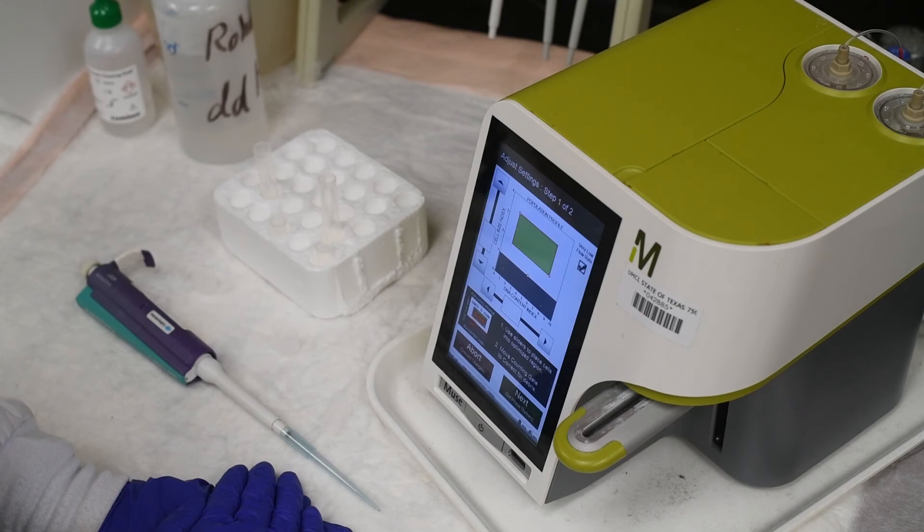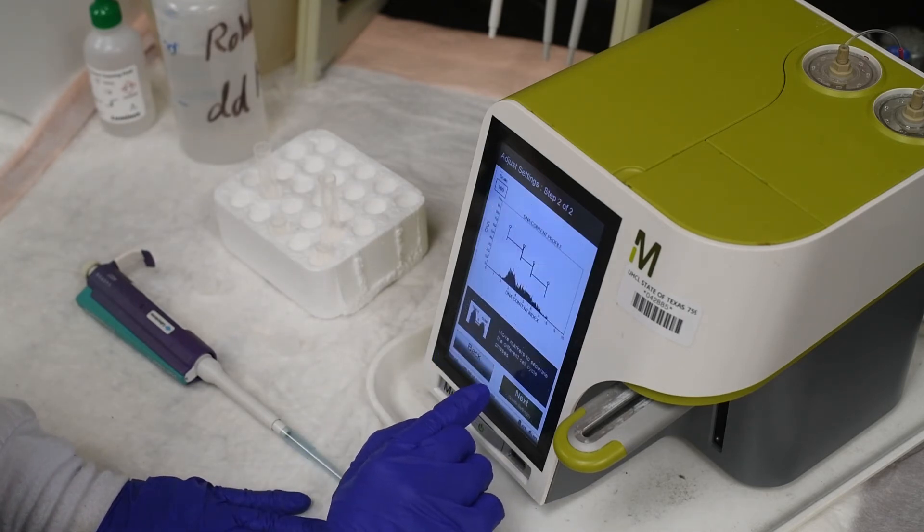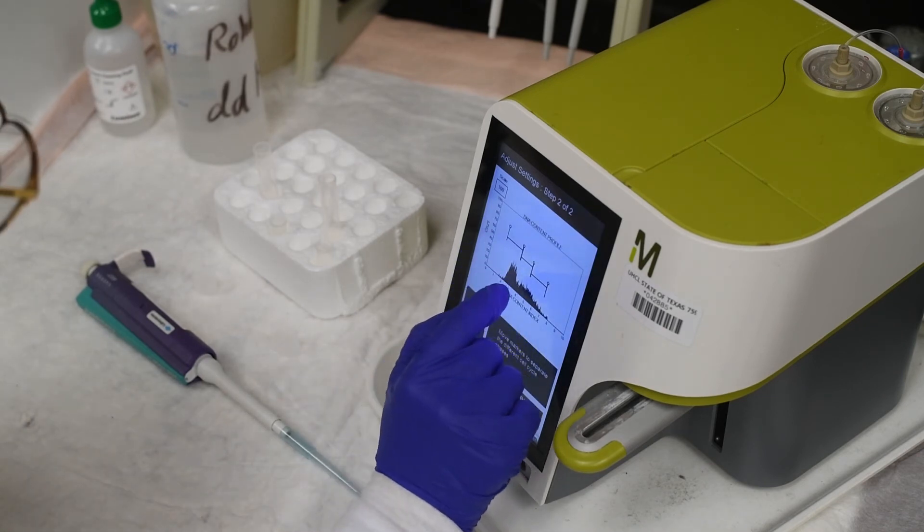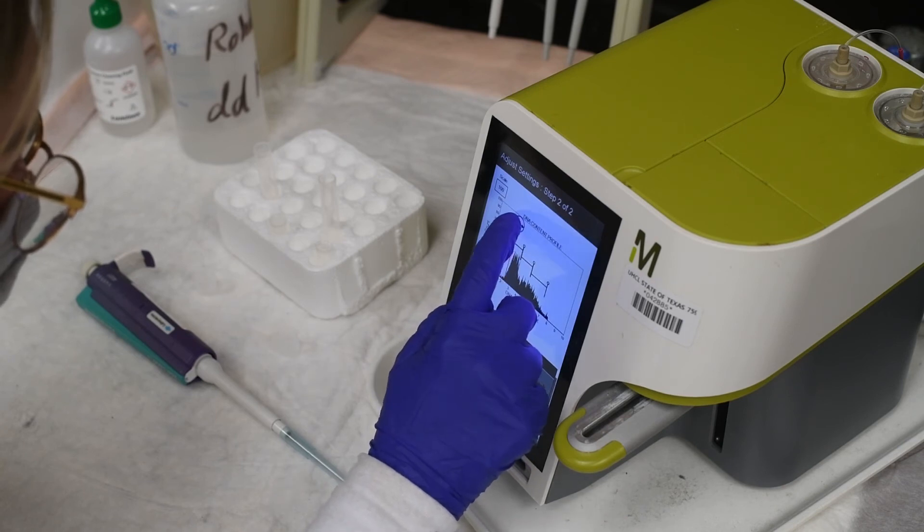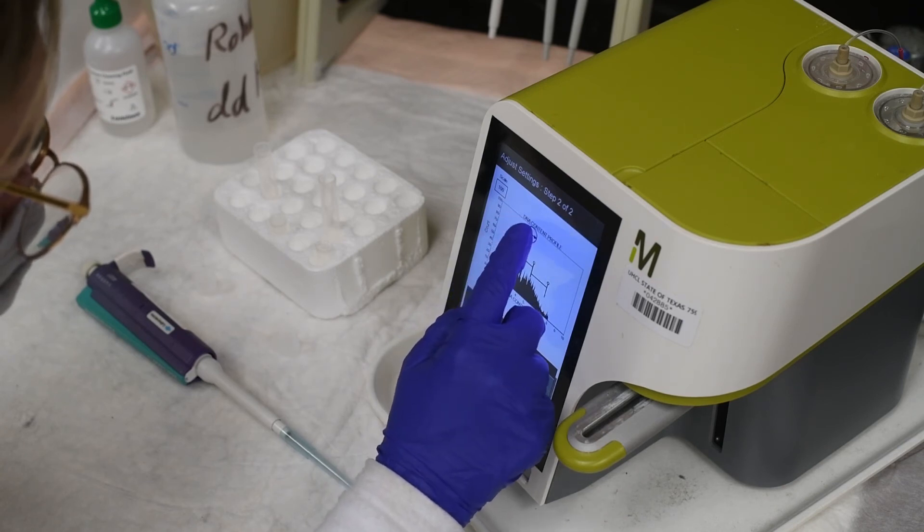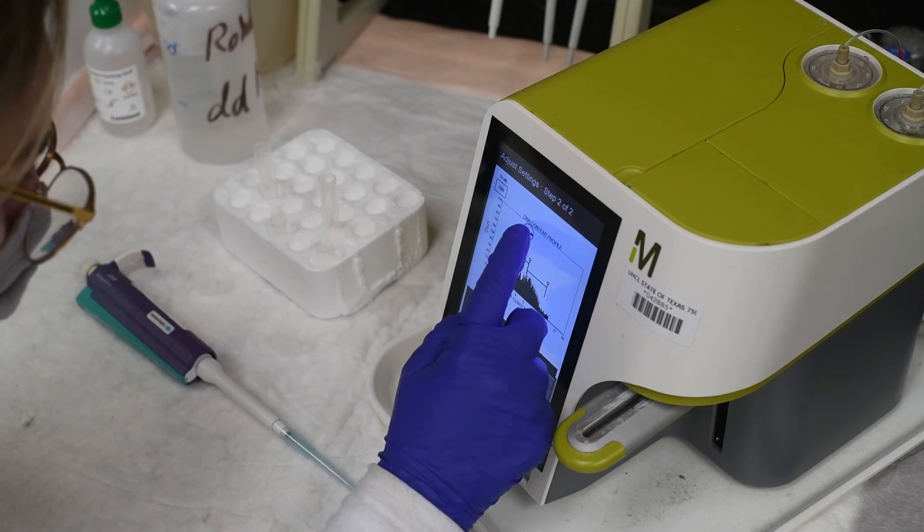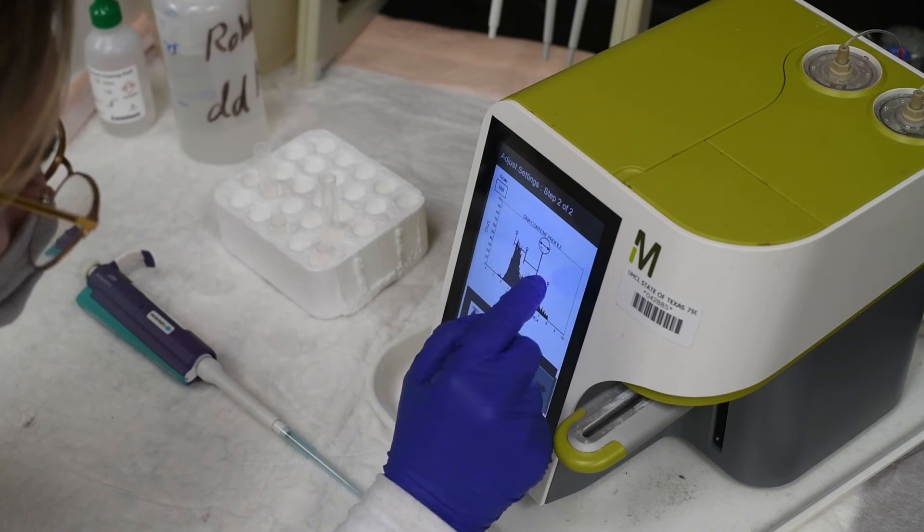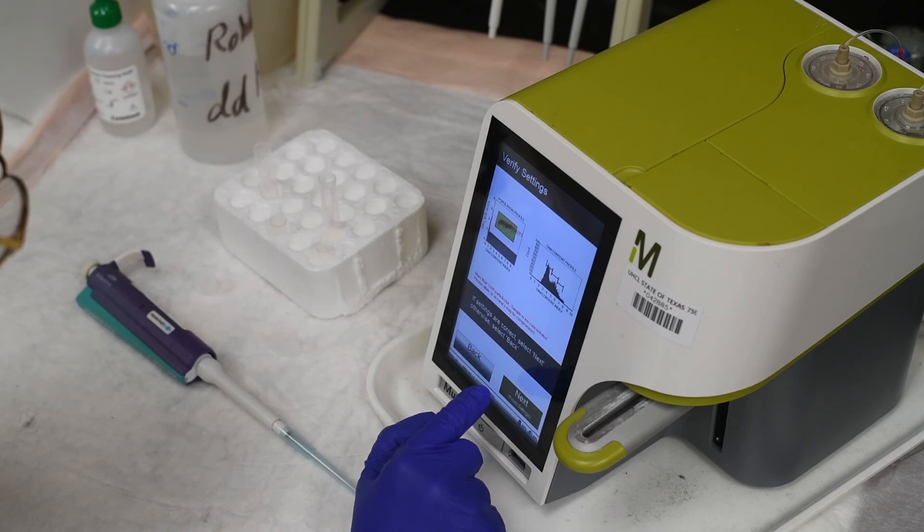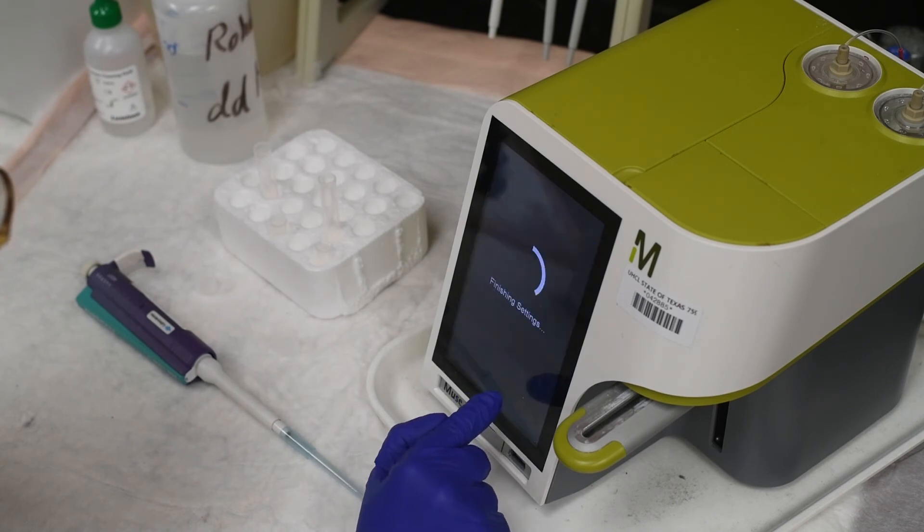Following the prompts on the Muse analyzer for running the assay under the cell cycle menu, I fine-tuned the settings for my DNA content index versus cell size index plot. Once those adjustments were completed, I fine-tuned the settings for the DNA content profile. I made each phase of the cell cycle around 1.5 tick marks wide. After completing both profiles, I verified and saved my settings.